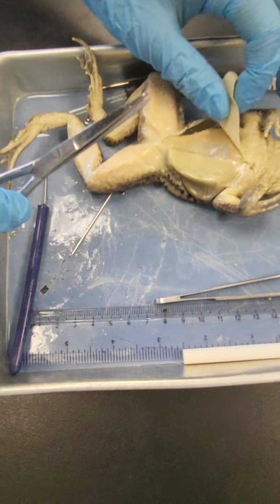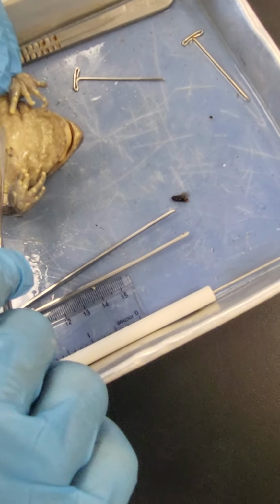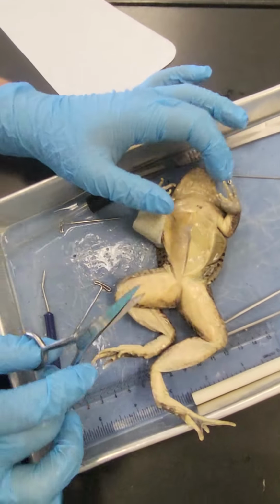No, just cut the top. Don't tear it out. You don't need to tear the whole thing out. Just cut the top part a little. Yeah, like that. And then do it for the other side.